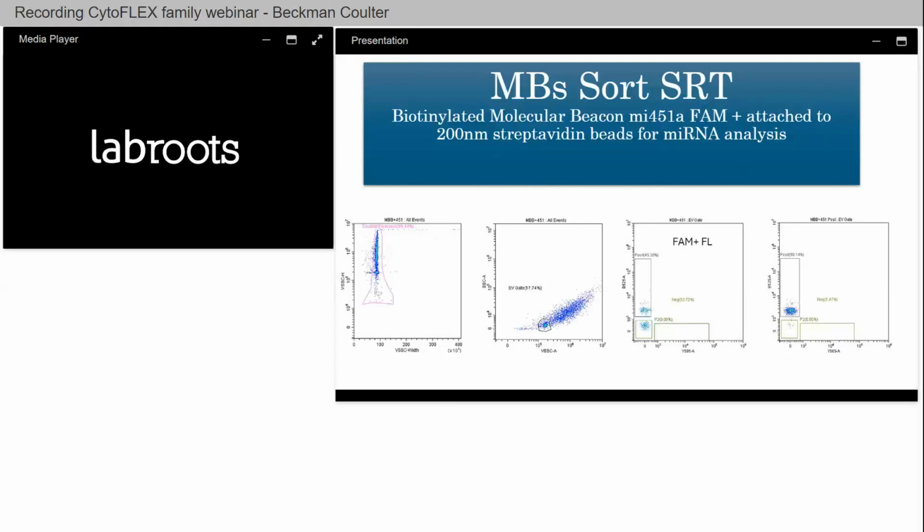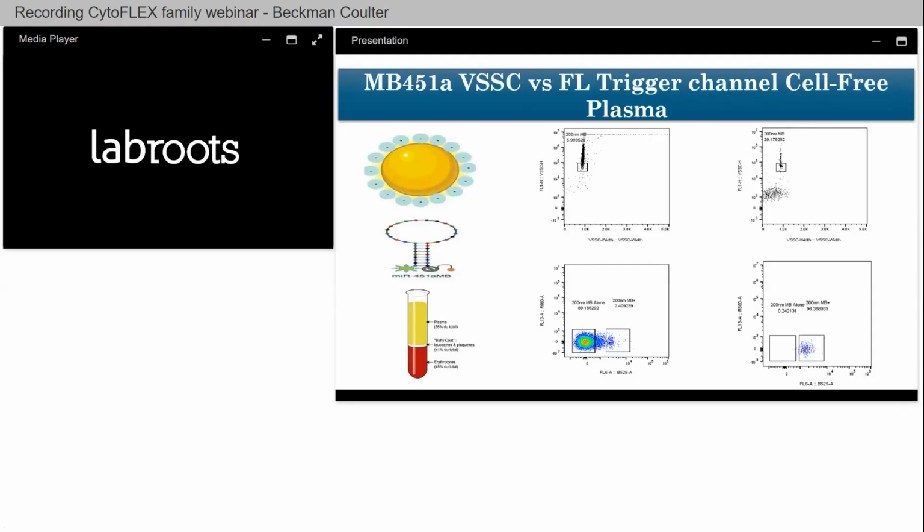As you can see here, we have our bead population that we were able to isolate, making sure that we did not have any on the far left there, and that there were no duplicates presented. Then we looked for the beads specifically because they do have, as we said, a reporter, which is fluorescein, also known as FAM, and then just sorted on that FAM-positive fluorescence reporter. But again, beads, targets, got a test, but it's not what's really interesting, right? It's not the great sexy portion of how to do these things.